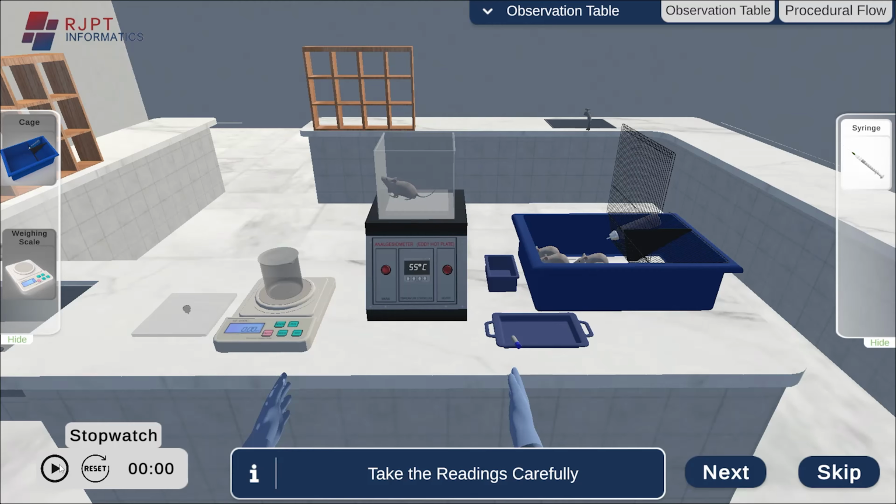Casually, the timer before administering the drug will last only between 6 to 8 seconds. That's the algesia induced by the analgesiometer. We will record the timer for each and every mouse.